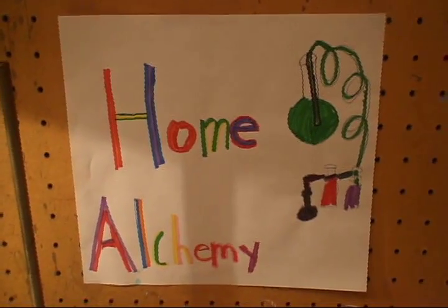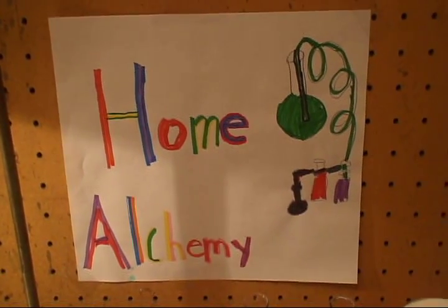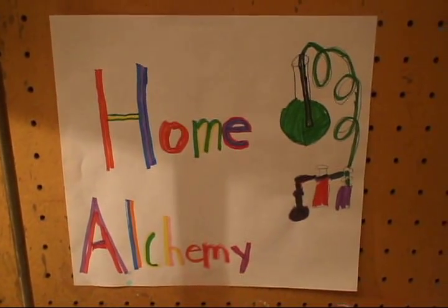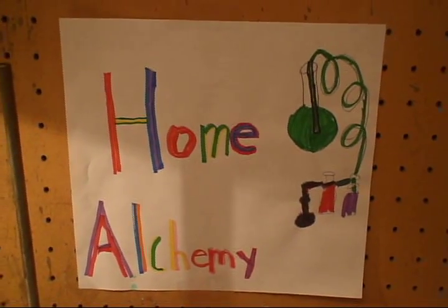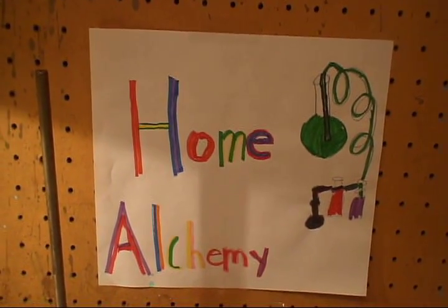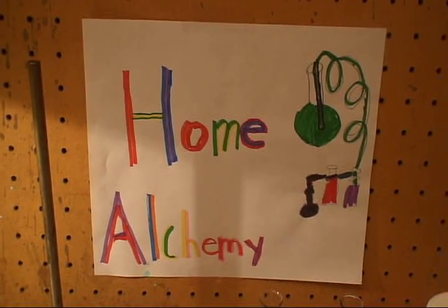Welcome to HomeAlchemy's very first experiment. Today we will be making copper carbonate out of two very common and easy to obtain chemicals: copper sulfate pentahydrate and sodium bicarbonate, also known as baking soda.